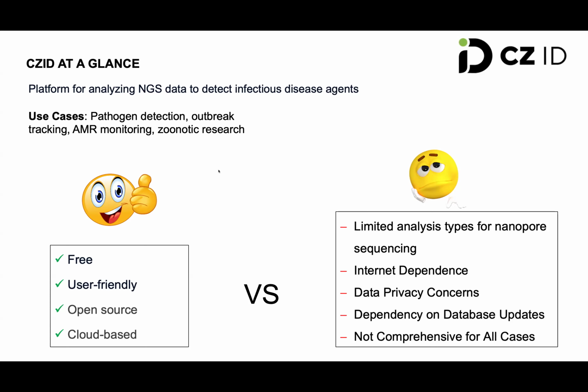Then it's open sourced and cloud-based, which is an advantage because you don't need a really good computer or a huge data processing computer.